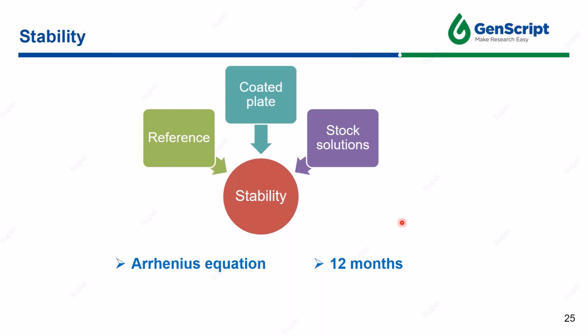So stability is evaluated by analysis of at least 3 replicates of core QC concentration level before and after stability storage. The mean accuracy in the measurements at each level should be within 20% deviation of the theoretical concentration in principle.